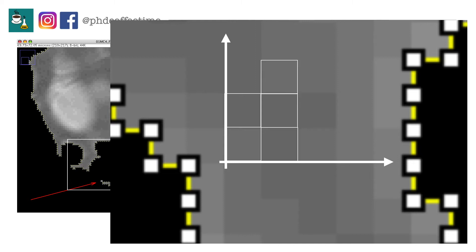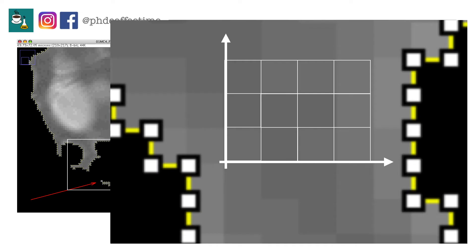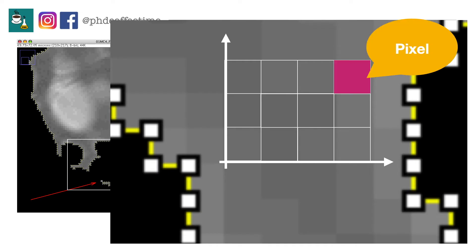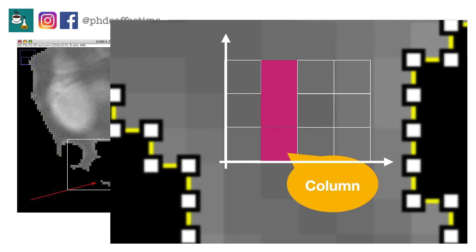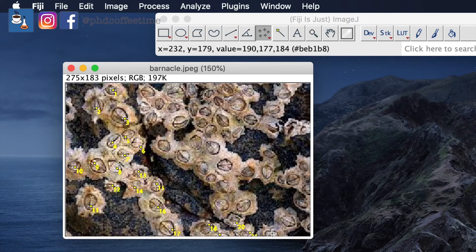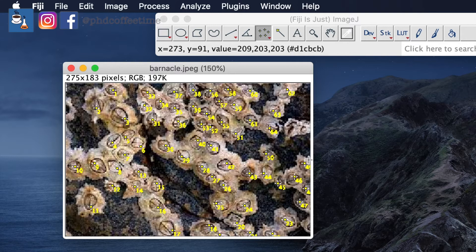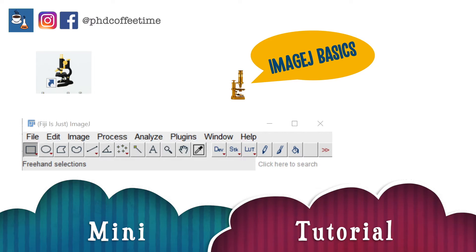Combining different levels of colored paint in one pixel produces different colors. Technically, an image is just an X and Y dimension of boxes filled with high or low intensity values — that's what creates differences in signal. Another key use is counting: if you have many cells in an image, you can use ImageJ to threshold and isolate specific structures like nuclei stained in blue, and it will count all objects passing that threshold value automatically.